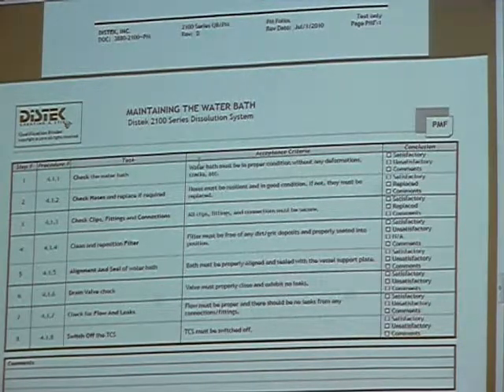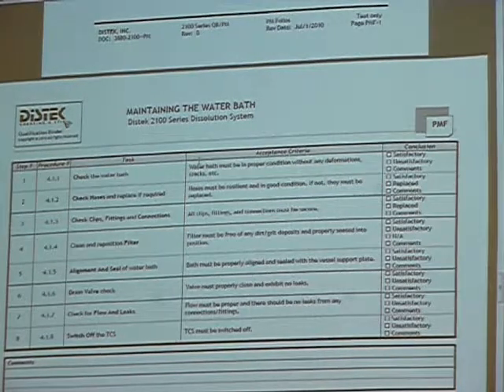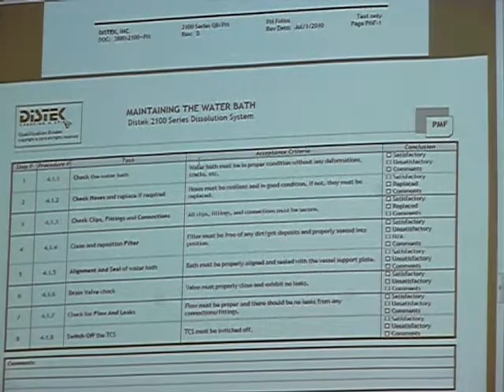I'm going to show you guys how to do it. I'm going to give you guys this little piece of tubing to use. And when I show it to you, you guys will be amazed that you didn't think of something like this before. But I'm going to have you do that. I clean and reposition the filter on everything.